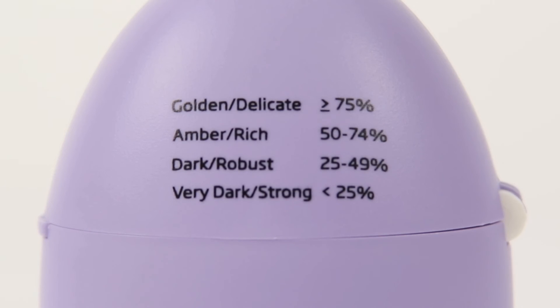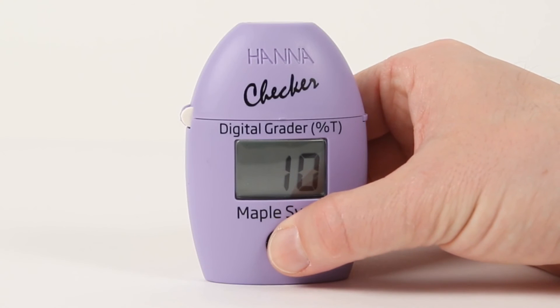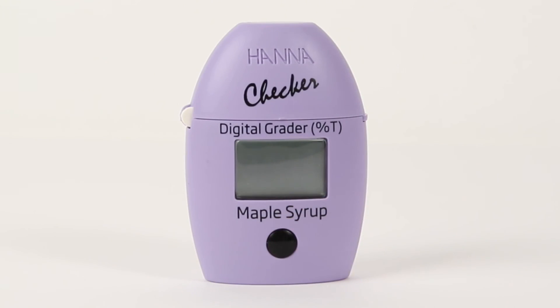You may correlate this value to a color grade — golden, amber, dark, or very dark — using the table printed on the back of the meter. Pressing the button again will prompt you for another sample, or pressing and holding the button for three seconds will turn the meter off. You will have to recalibrate when you turn the meter back on.